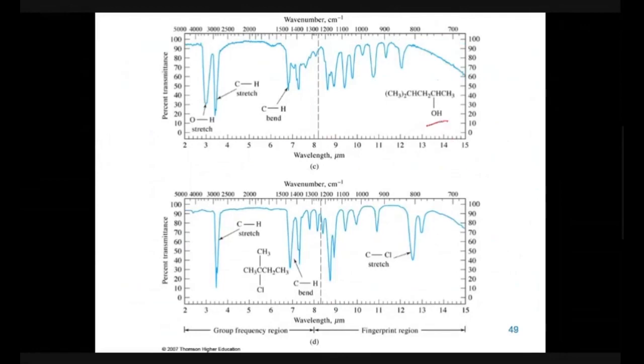Observe the spectra. Here you can observe the peak for hydroxyl group over here. This is typically around 3,400 to 3,500. This is the typical hydroxyl peak. And there is a CH peak as usual. Observe the left hand side of the spectra. The characteristic standout peak for alcohol is hydroxyl.